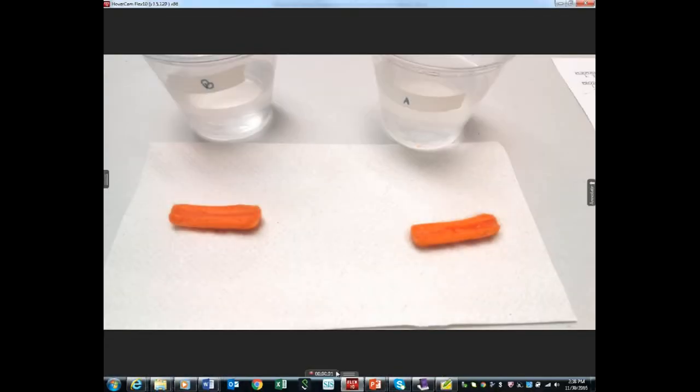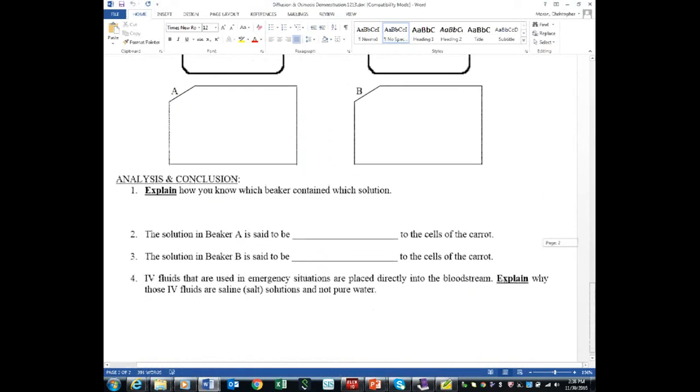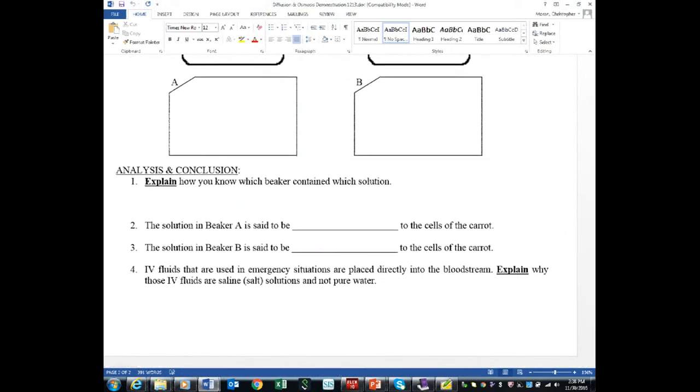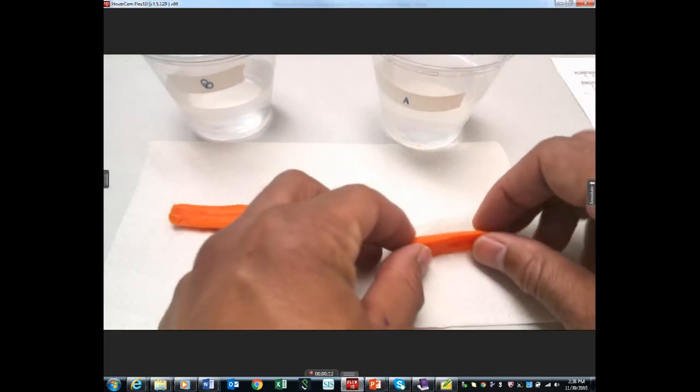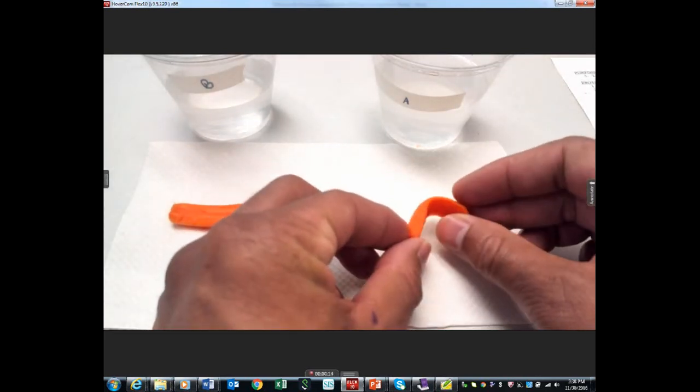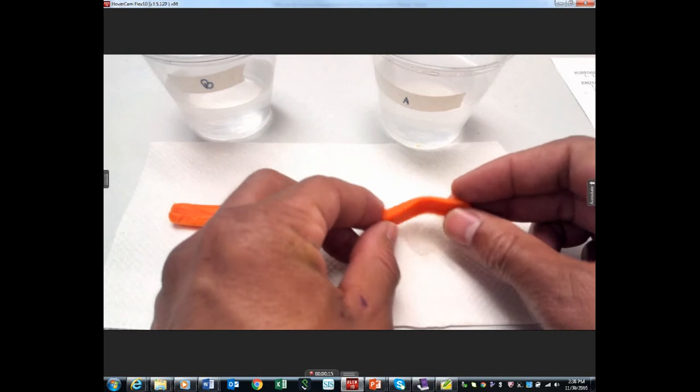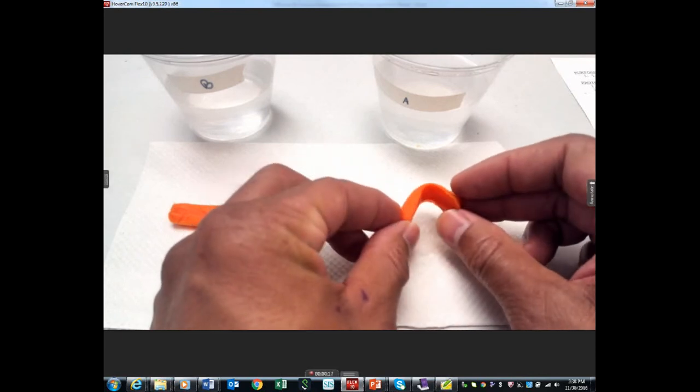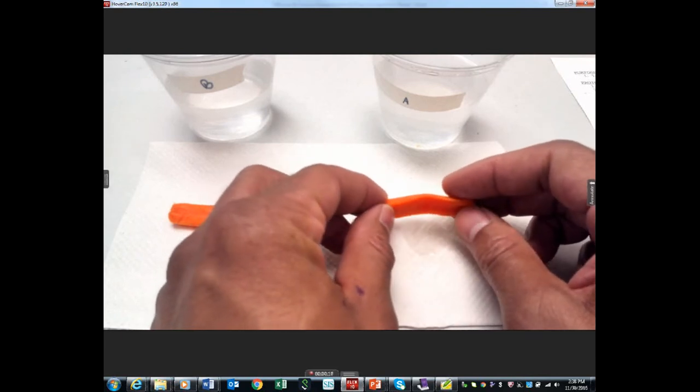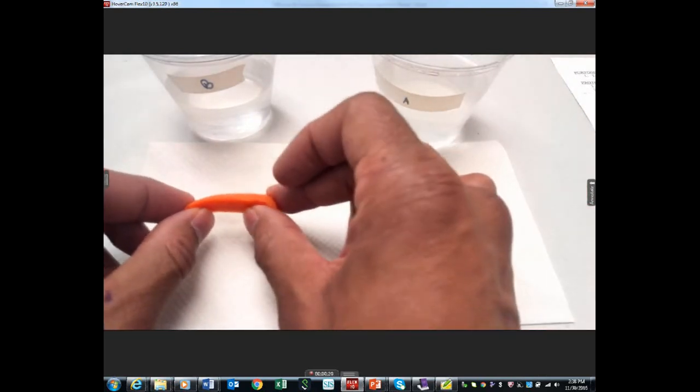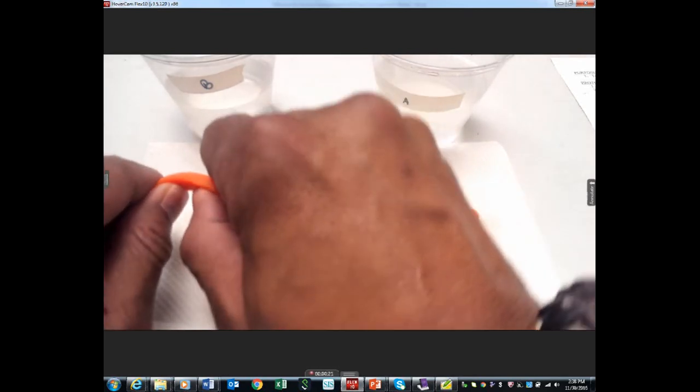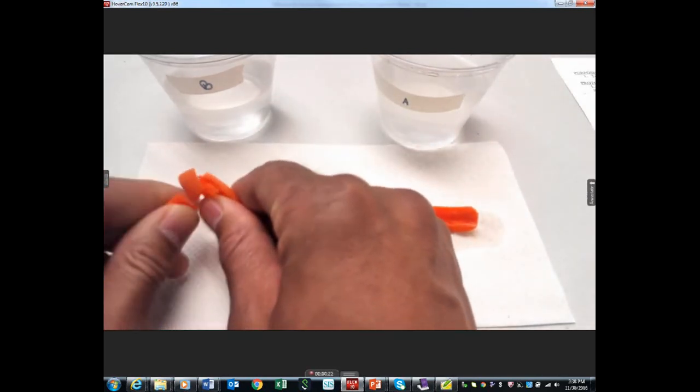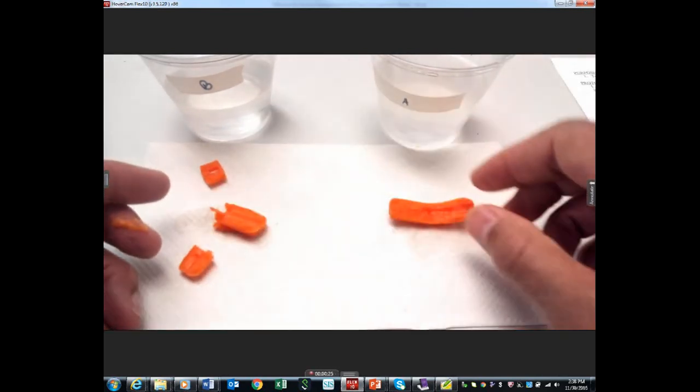We have our carrots now. You should have labeled what's going on, and down here we're going to write what's in A and what's in B. Take a look at A - it lost a lot of water. Look how flexible it is. That's because it lost water. B is very firm. Look how firm this is. I'd have to work hard to snap it in half.